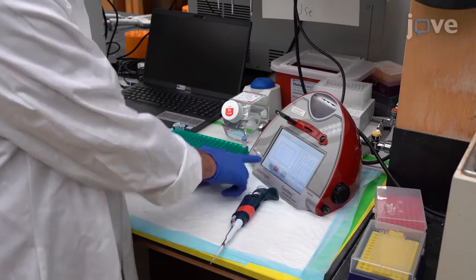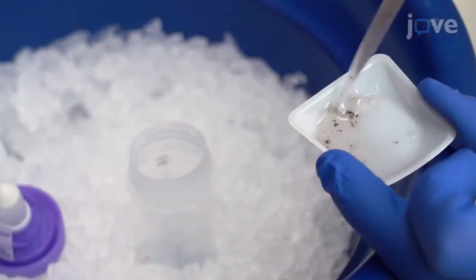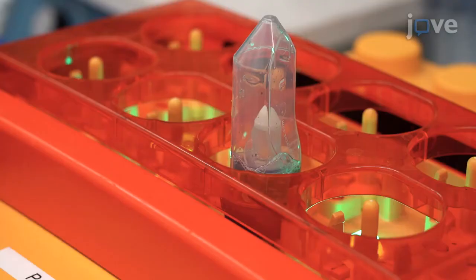When attempting this protocol, understanding your cytometer's configuration is a critical starting point, as all cytometers are not configured the exact same way. Thus, volumes of fluorescently conjugated antibodies may need to be titrated and/or fluorophores may need to be adjusted to optimize the protocol based on your cytometer's configuration.